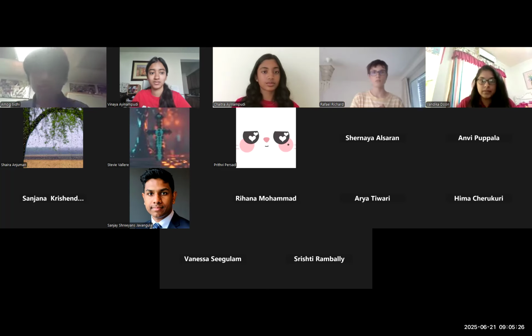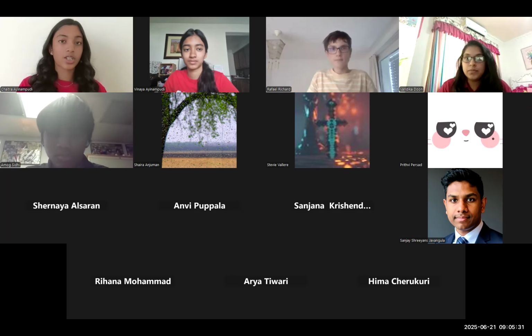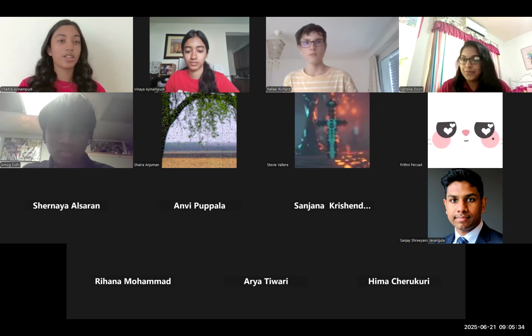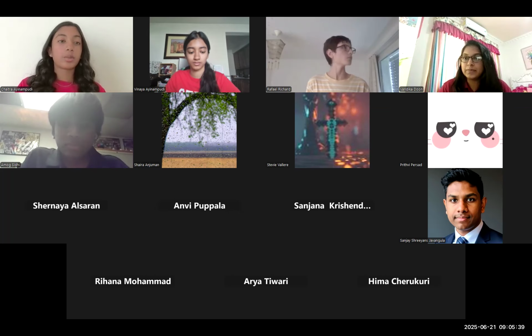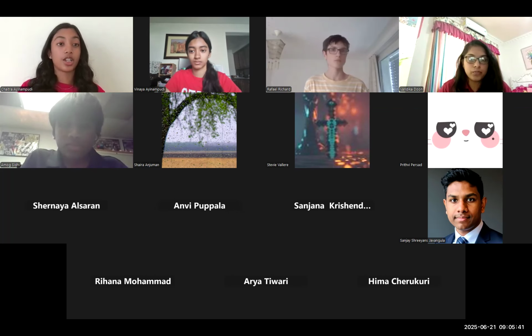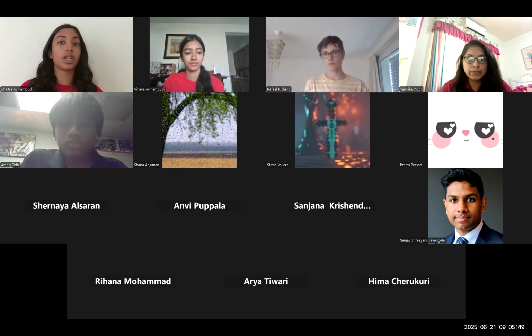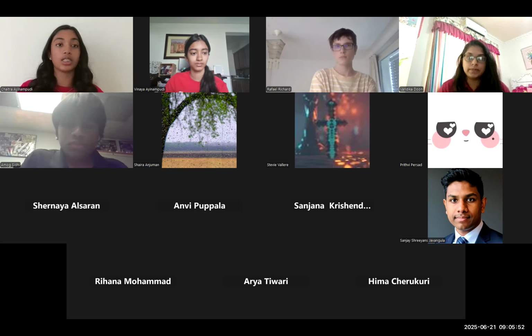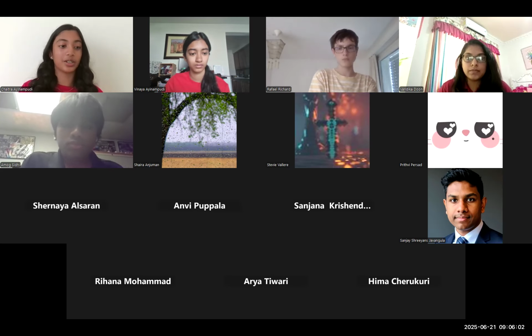Peter, do you want to answer that? So a heat shock is what we used for this transformation. It would depend on what you're using, but there would be circumstances where you would have to chill it, like make it in cooler solutions. And sometimes, like for this one, we're doing a heat shock, so we're making it go to a higher temperature since the original one was in ice. So it depends on the process. But yes, there definitely are different types depending on the lab that you're trying to do.